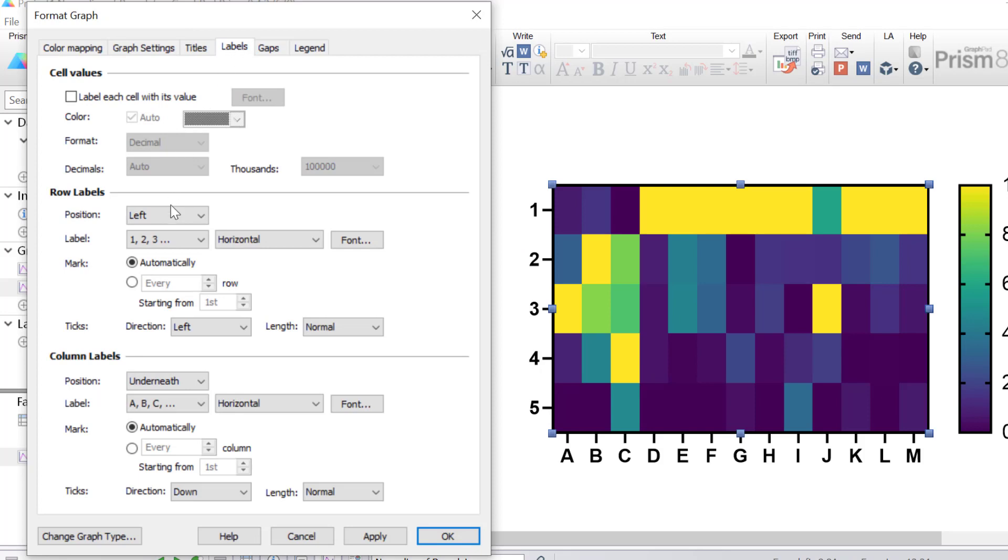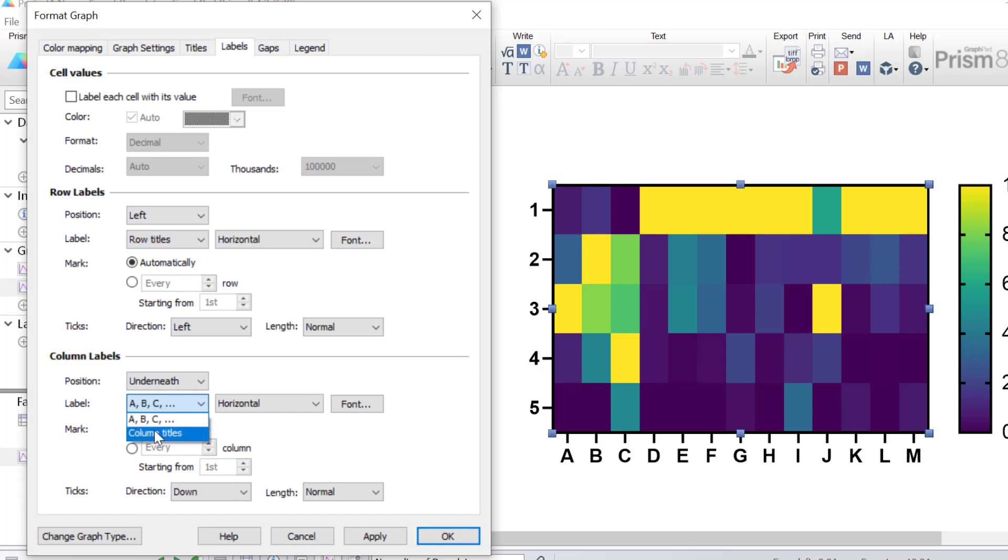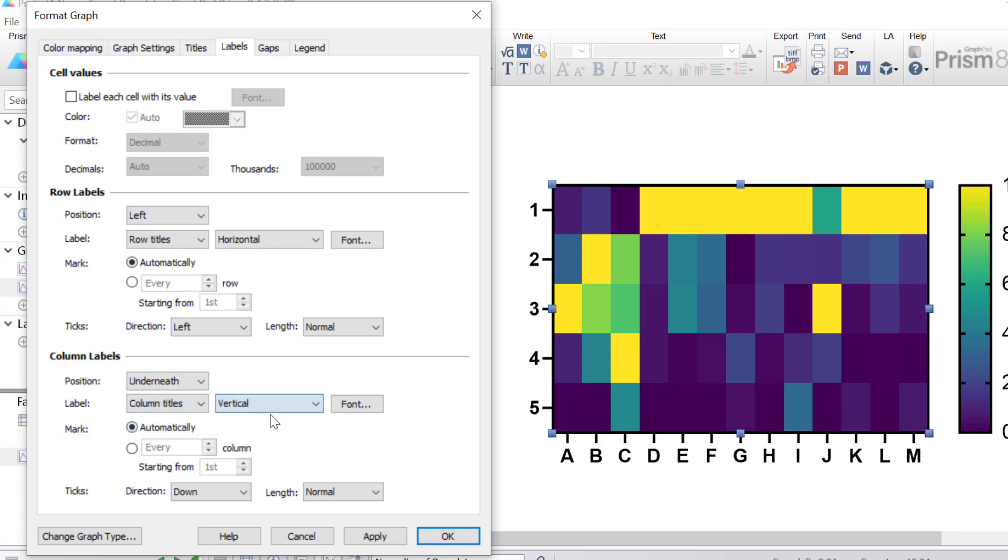I want my row titles to be shown, and I also want the column titles to be shown, and these are going to be in vertical orientation, and click OK.